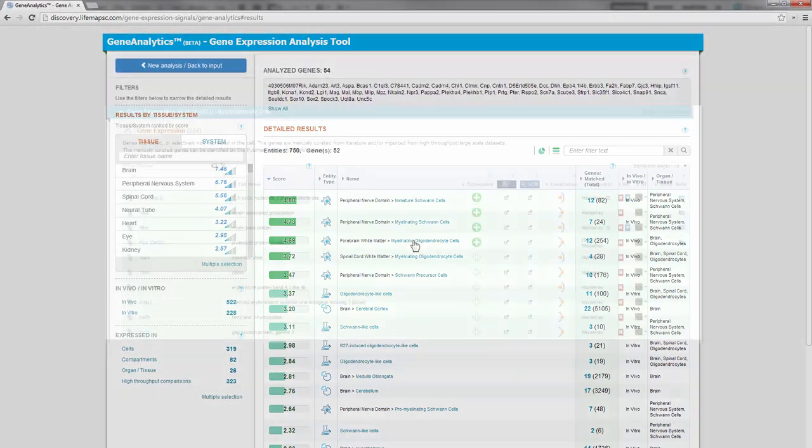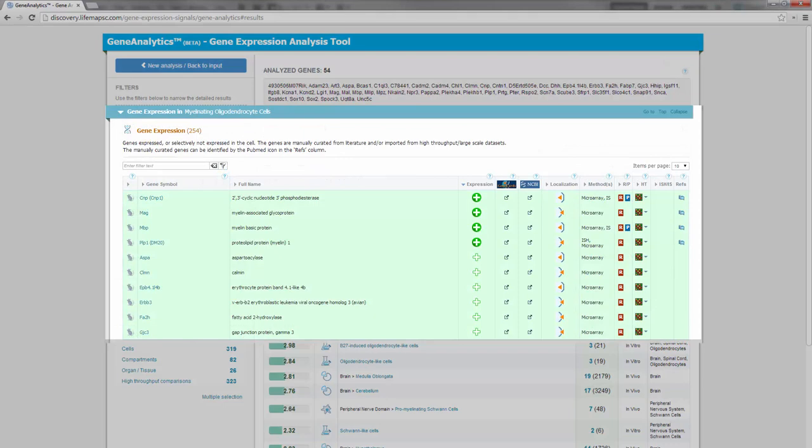Click on an entity, and you will see detailed information on gene expression and evidence supporting each matched entity.